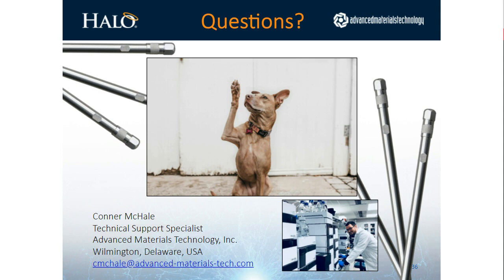Once you get a divot, and usually it's in the inlet side of the column, we'll have customers say, oh, there's a void in the column, or they're getting some split peaks or something like that, and I'll ask about their method conditions, and a lot of the times I'll tell them to return the column. I like to see the issue myself, and I'll pop off the inlet side of the column, and you'll see it, not all the time, but there's been many scenarios where we inspect the column.